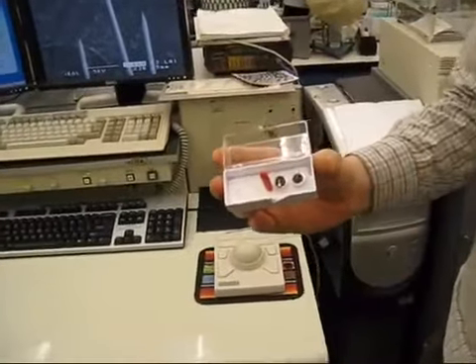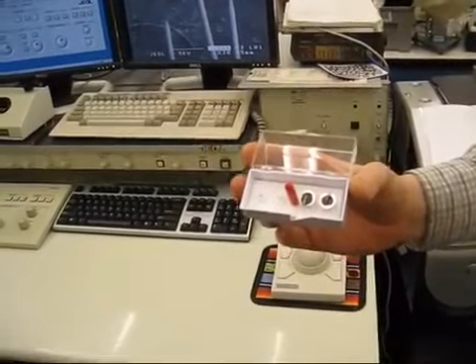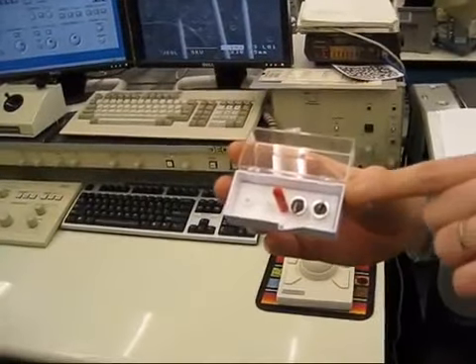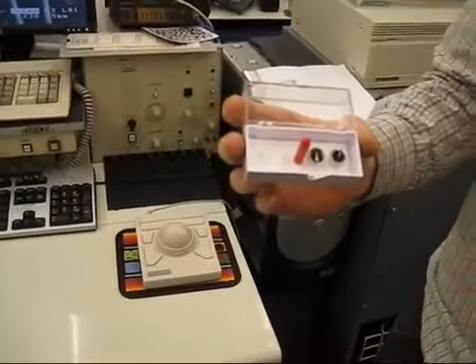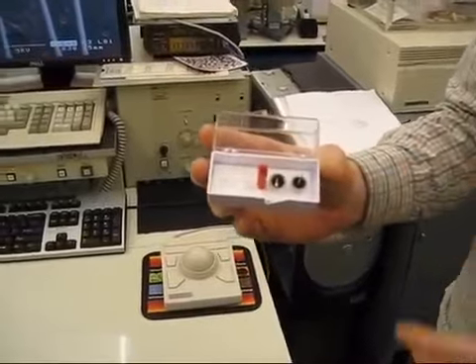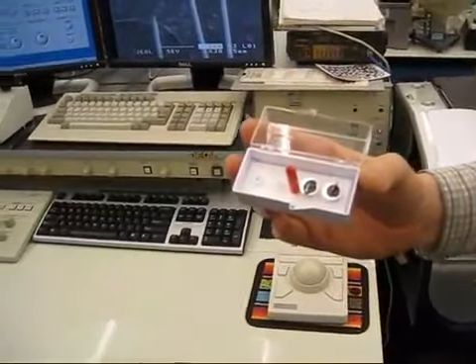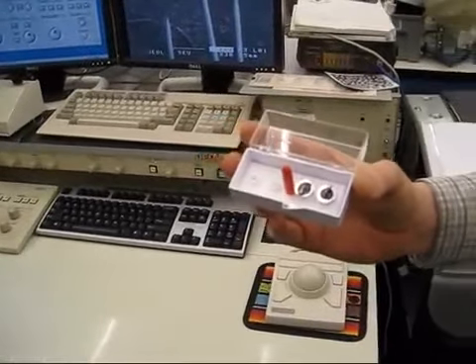They're basically a timing crystal. You find them on computer motherboards and other locations. But we have a little trick where you can cut out this cylinder and expose the tuning fork itself. This has been used in scanning probe microscopy, where they use a tuning fork method. So we physically mount our etched metal onto the end of these tuning forks.